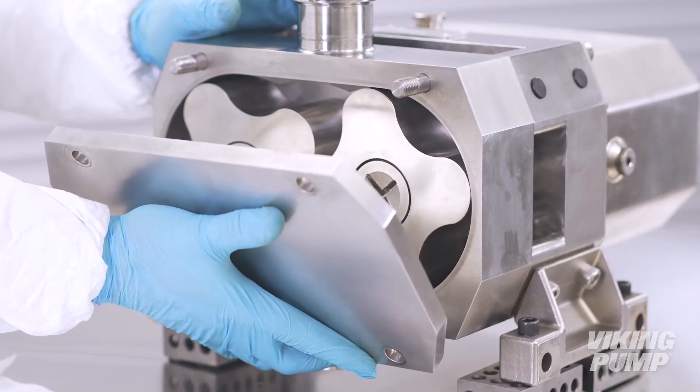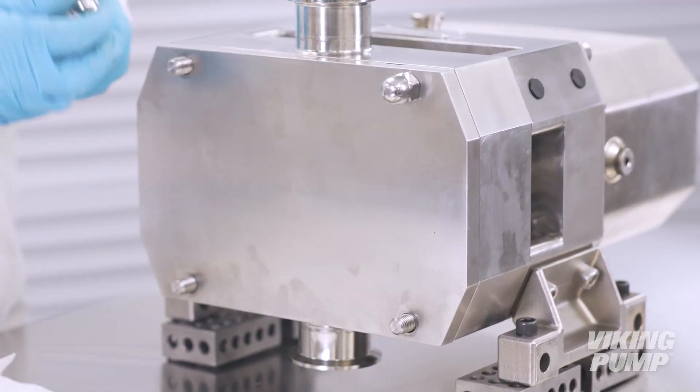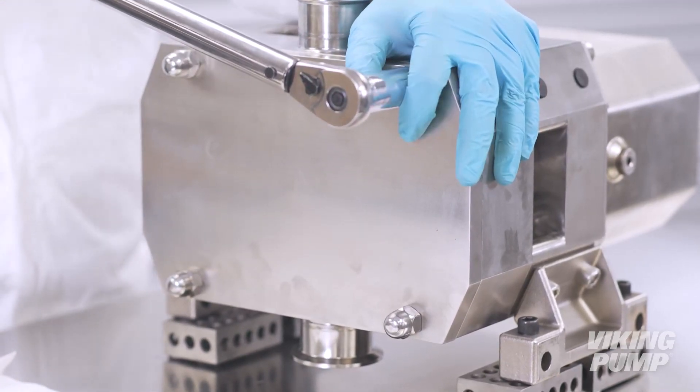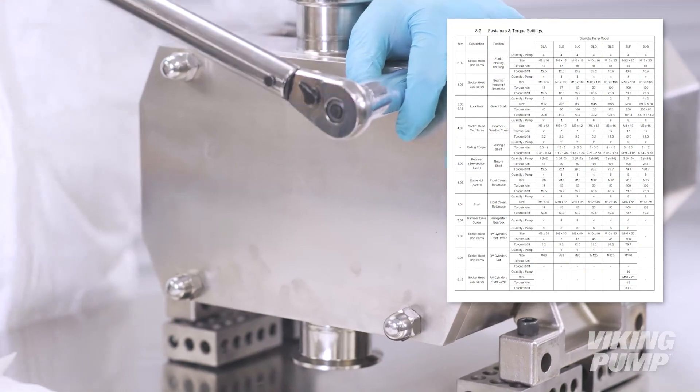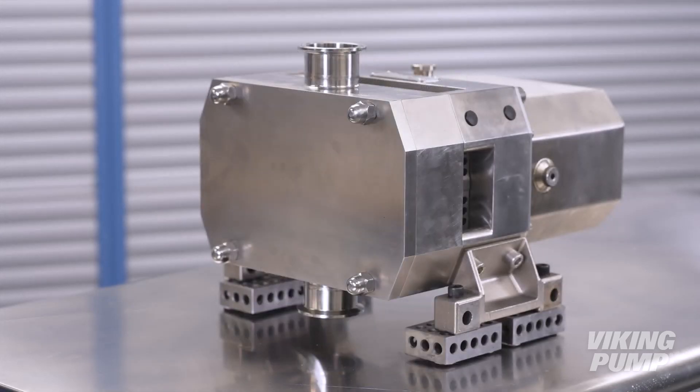Reinstall the front cover and dome nuts. Torque the dome nuts to the appropriate setting as listed in the service manual. For pump lubrication, Viking Pump Sterelobe Series pumps are supplied from the factory already filled with lubricants. Please refer to the technical service manual for proper lubrication and greasing procedures. Your Viking Pump vertically ported Sterelobe Series pump is now ready to be put back into service. For more information, please visit our website at VikingPump.com.